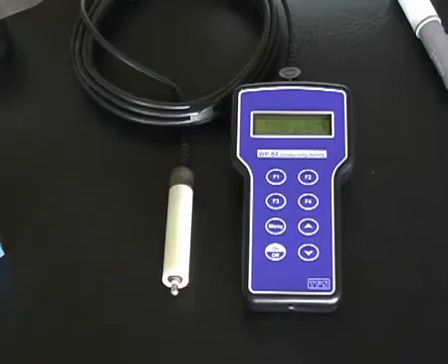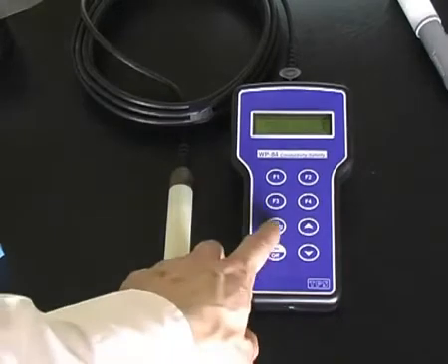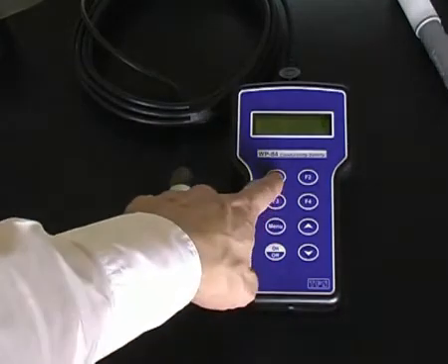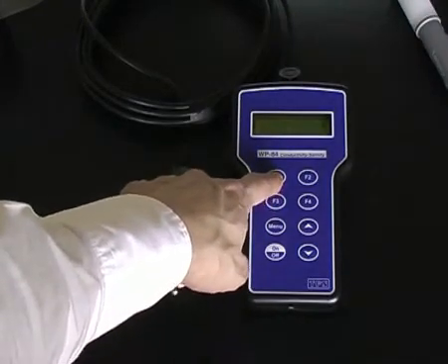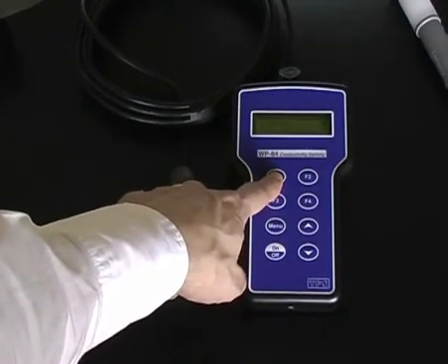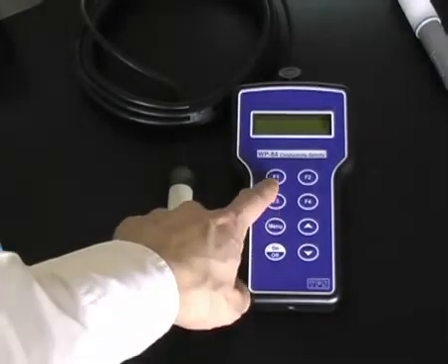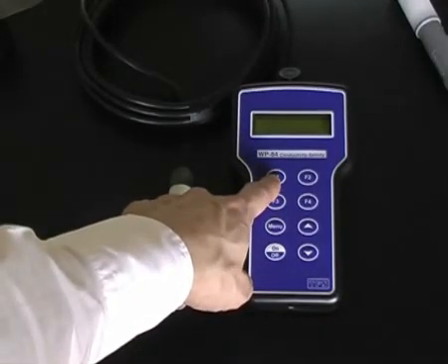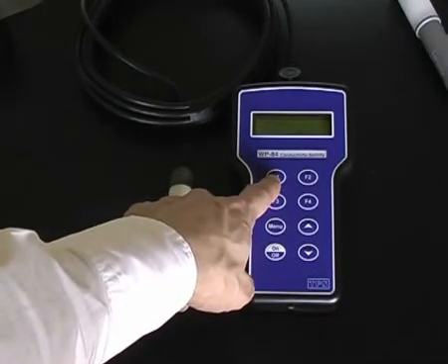To calibrate the TPS-WP84 conductivity TDS meter, the procedure is the same as the 90FLT. Press Menu, F1 for Cal, F1 for conductivity, and then press F1 to accept calibration instead of the Enter button.